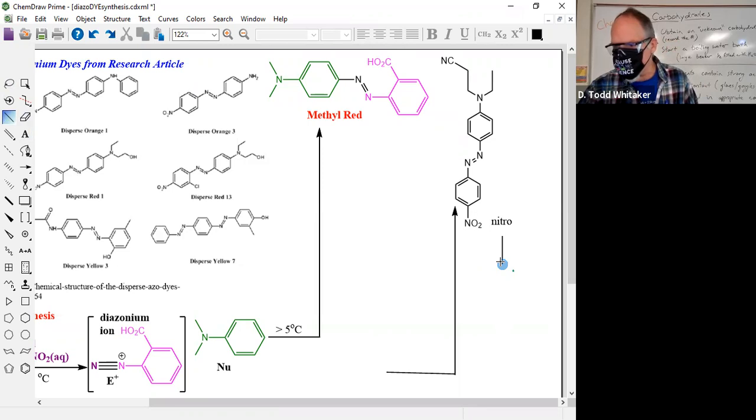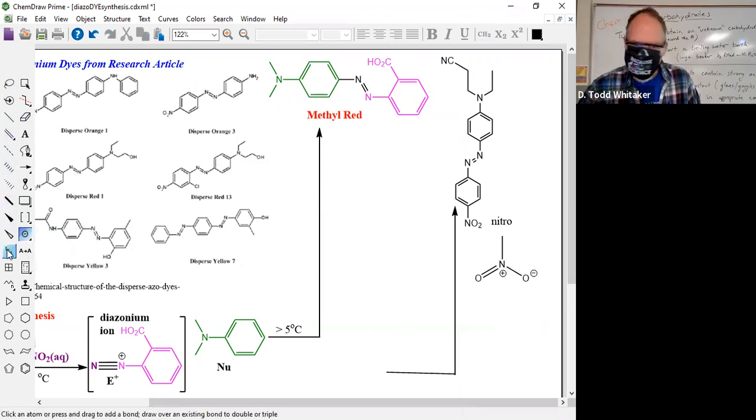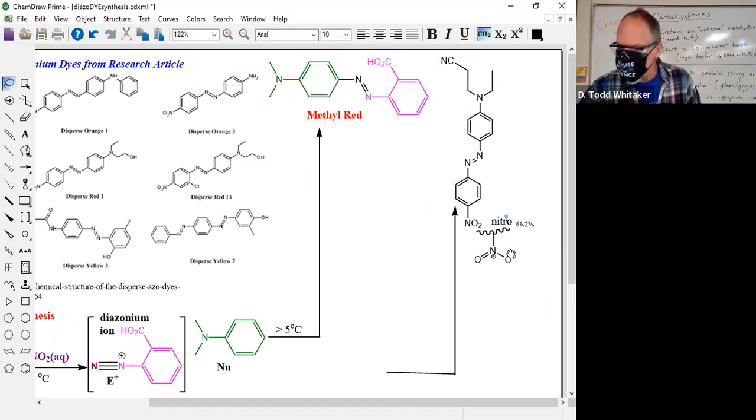It's the opposite of a nucleophile because the nitrogen has 4 bonds, and formal charges up the wazoo. And I don't know what that expression means. Haven't heard it in a long time. There's your nitro. Way too big.